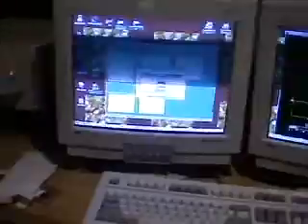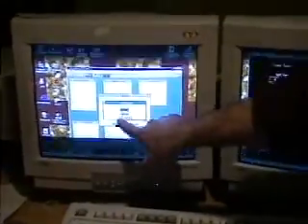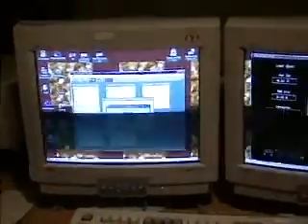Then, again, here's something where you have to fight the instincts that you have from using many other software programs. You might think you want to click on OK. If you did that, that would transfer control to the computer, and the computer would start an automatic approach. That's not what we want. So instead I'm going to click on Cancel.